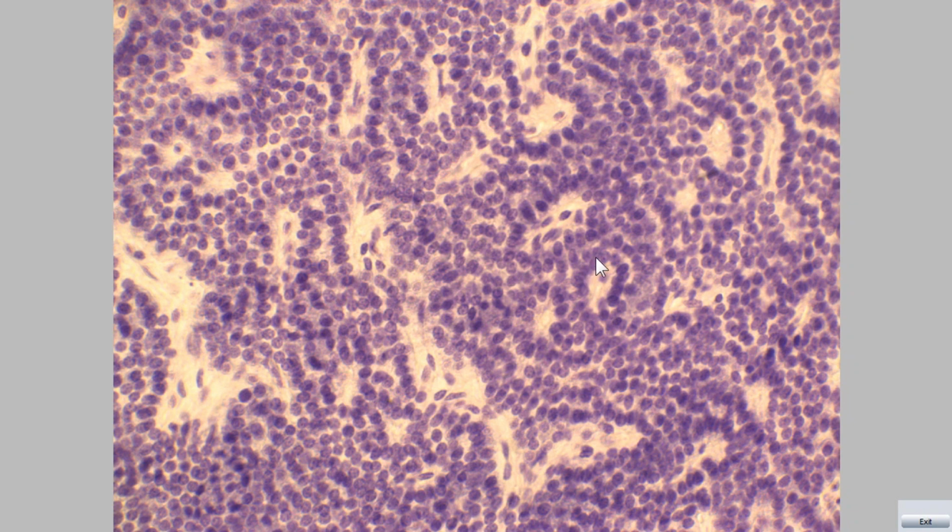These cells have a rounded nucleus with a slightly acidophilic cytoplasm, polygonal in shape, chief or principal cells. Polygonal with rounded nucleus and slightly acidophilic cytoplasm.